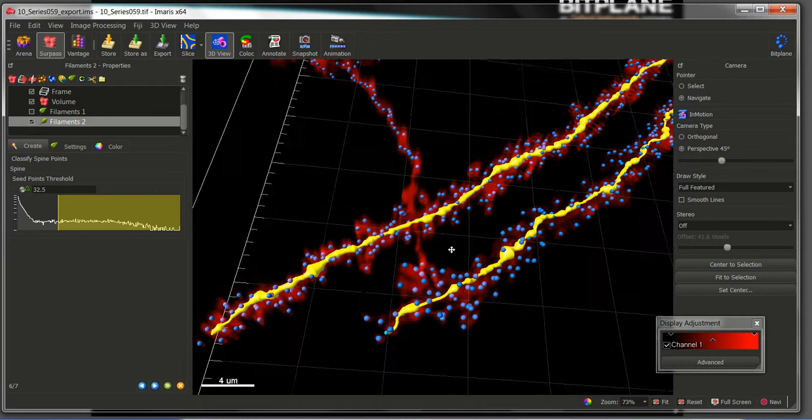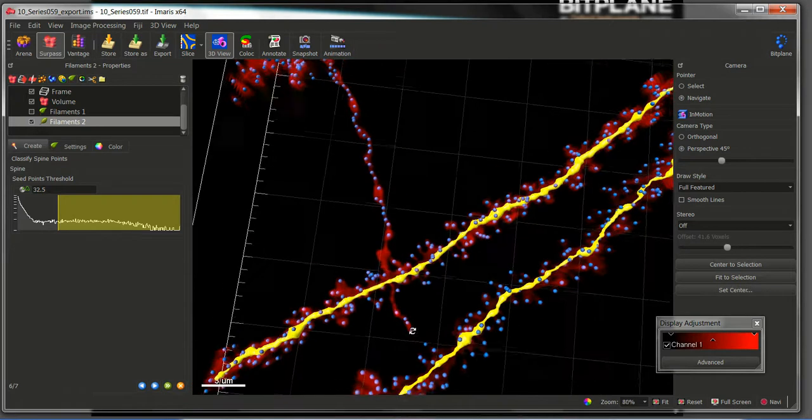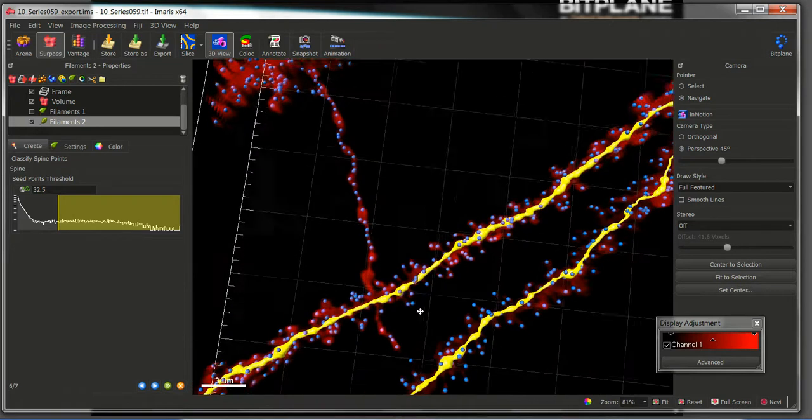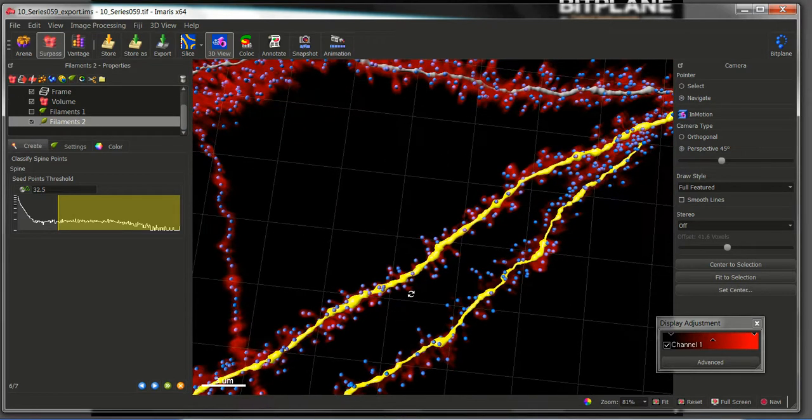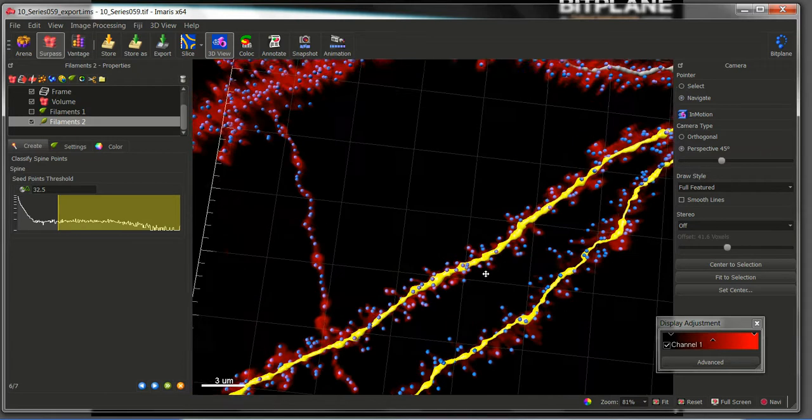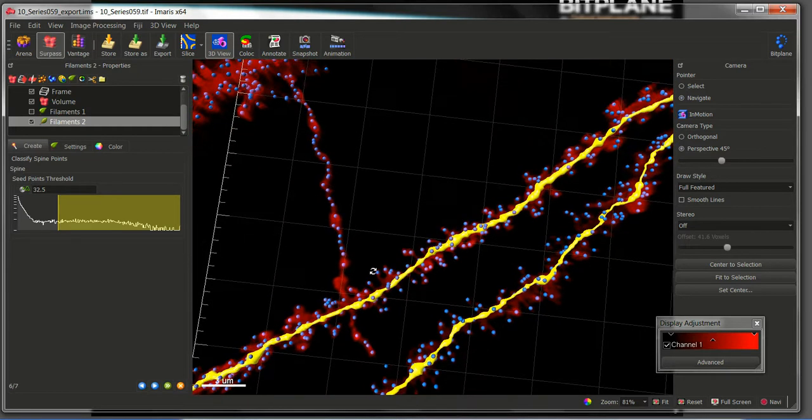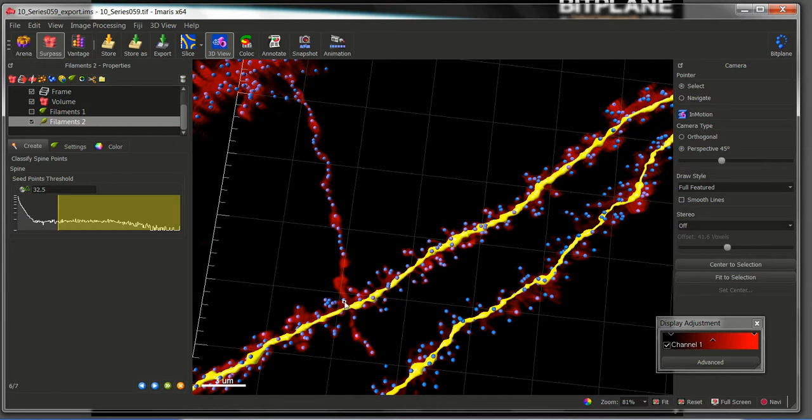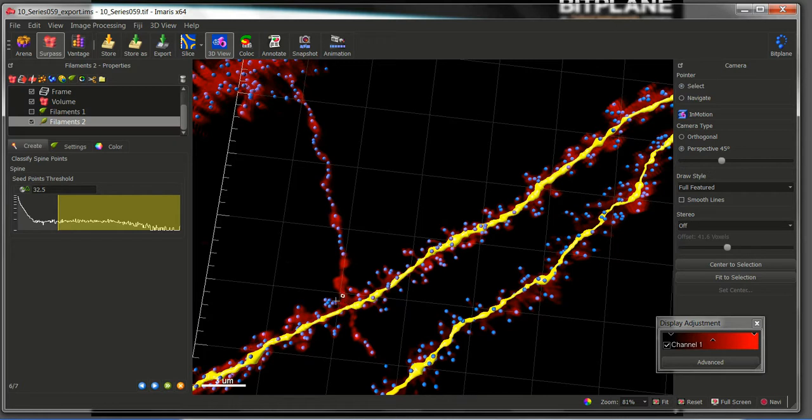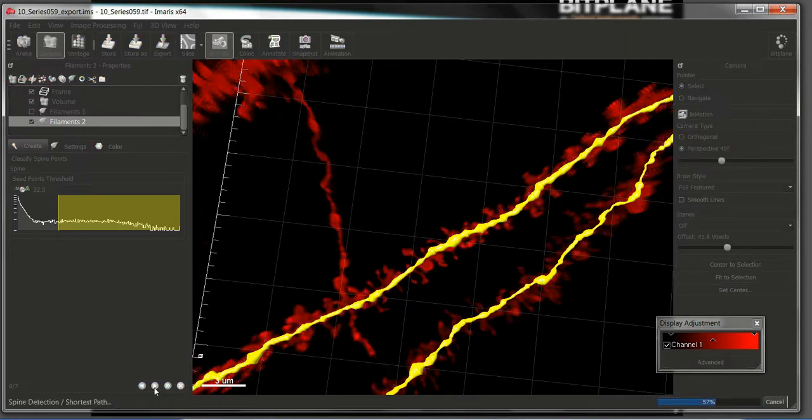Perfect. If we are missing, for example, a low signal spine, this is also your time to add it. In the same way we use the shortcut shift left click to remove a spine, we can use the shortcut shift right click to add a seed point. Okay, now we can continue.